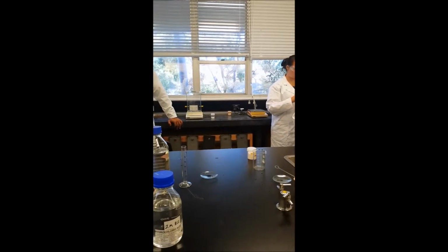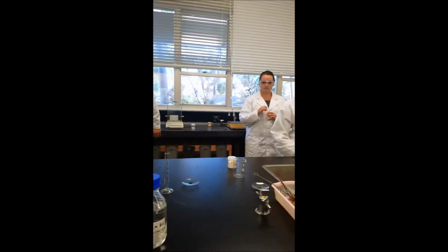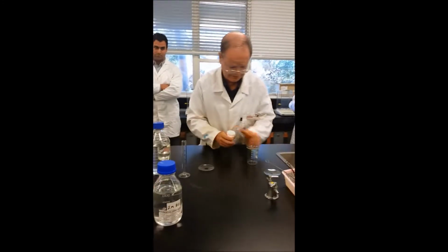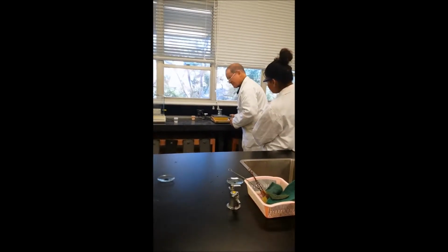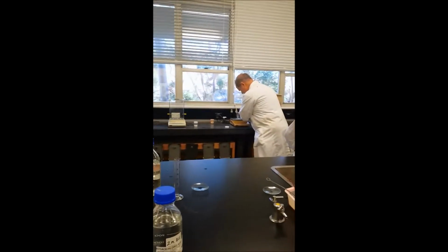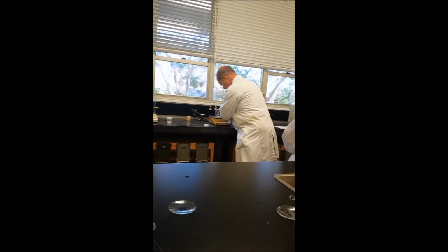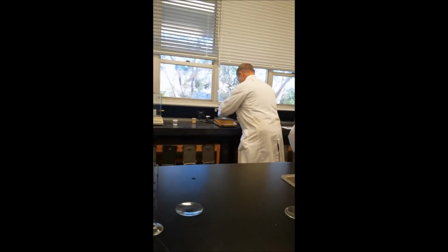Now, what we need is some still water. So we get a beaker, and the next one is starch. While they're doing that, I'll show you the quick way to do the starch. Put that on there, tare button. There's a zero, and now we need 1.0 grams. Okay, that's that. 1.0 grams.